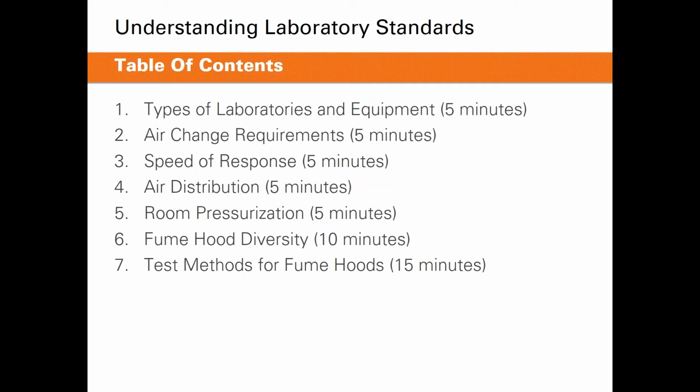Thank you, Nicole. So today we're going to start off by talking about the types of laboratories and equipment that you may see and what standards apply to each of those types of rooms and equipment. We'll then talk about the air change requirements that are required and recommended from the standards in laboratories. We'll talk about the speed of response and how that's defined in the standards, as well as air distribution and recommendations for laying out diffuser and fume hood placement.